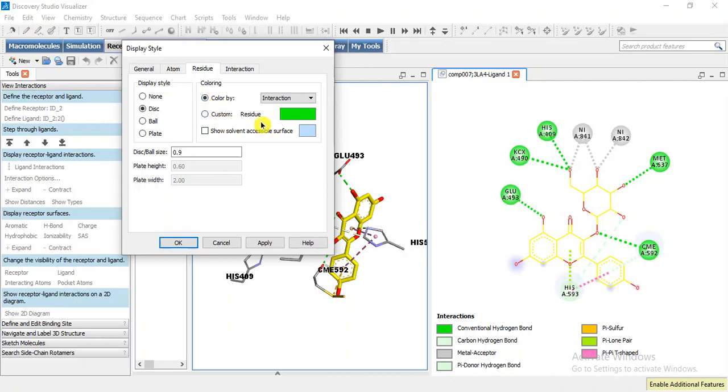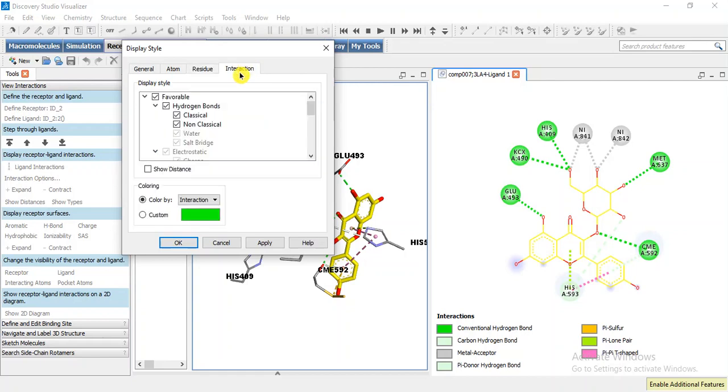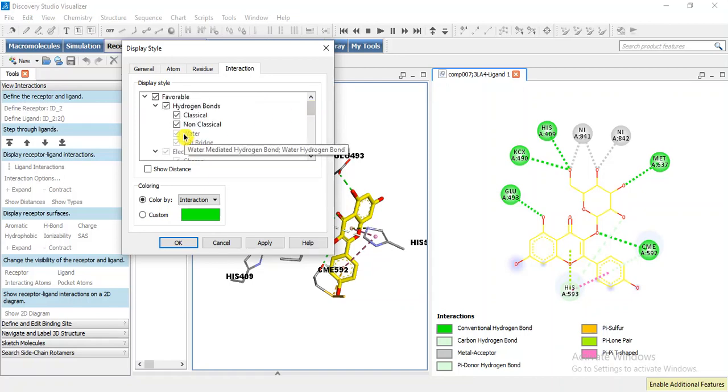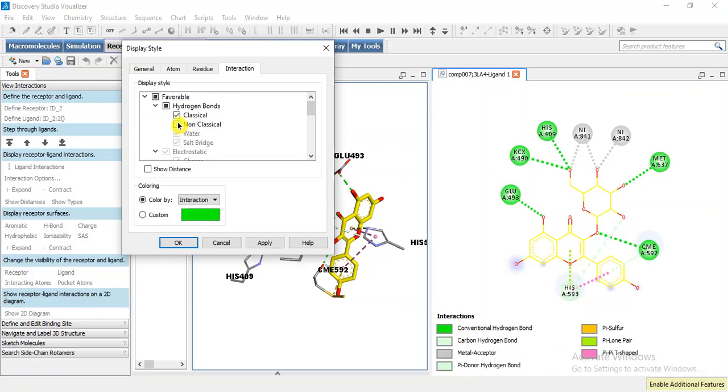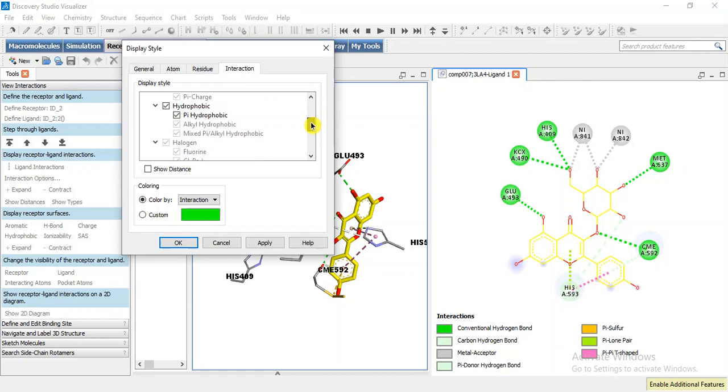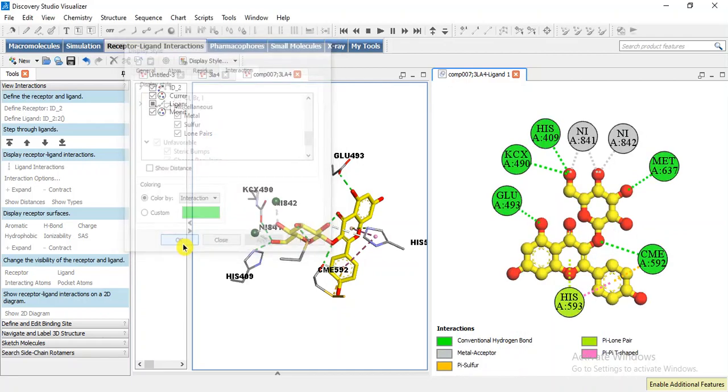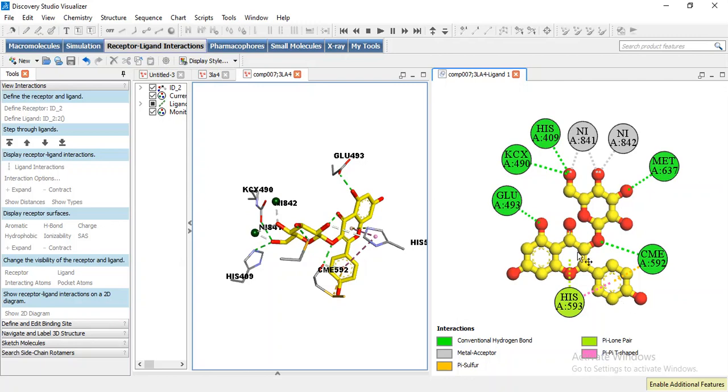We can also color these residues differently, but if it is colored by interaction then it will be best. Now moving on to interactions, I will remove non-classical hydrogen bond and keep others which are hydrophobic interactions and these are the metal interactions. I am going to keep metal interaction, so apply. Now it is our 2D docking pose and you can make it according to your taste.